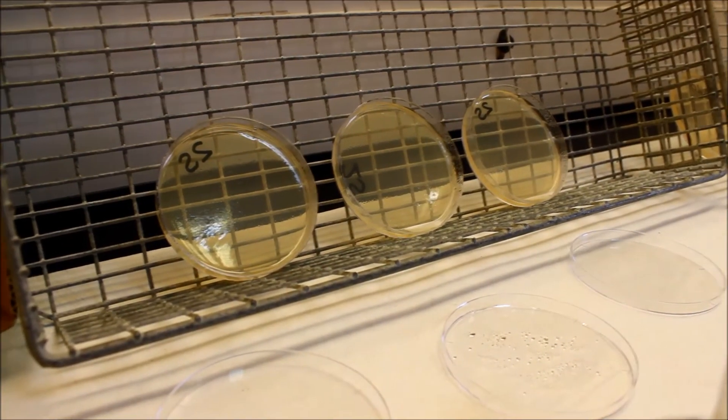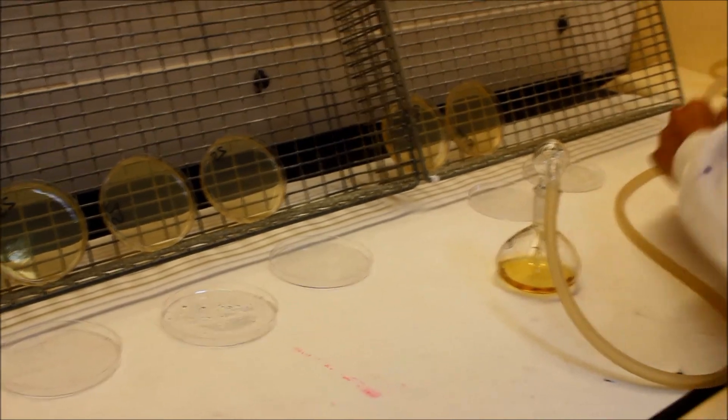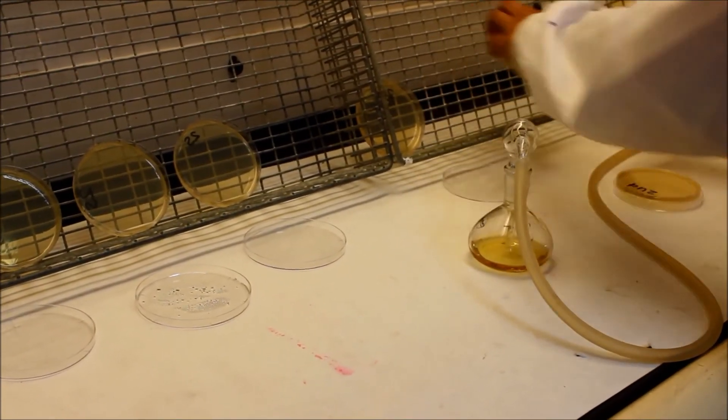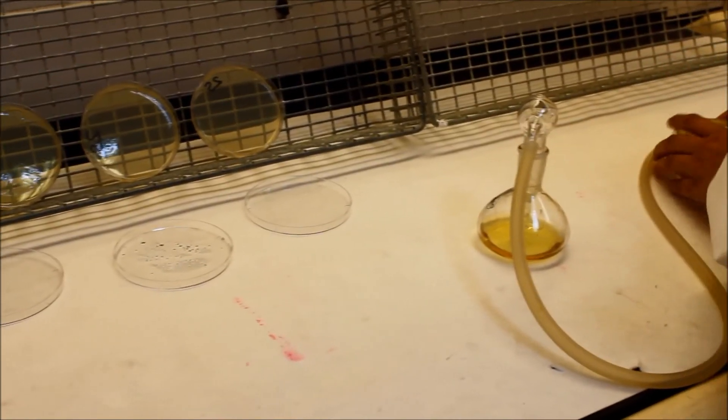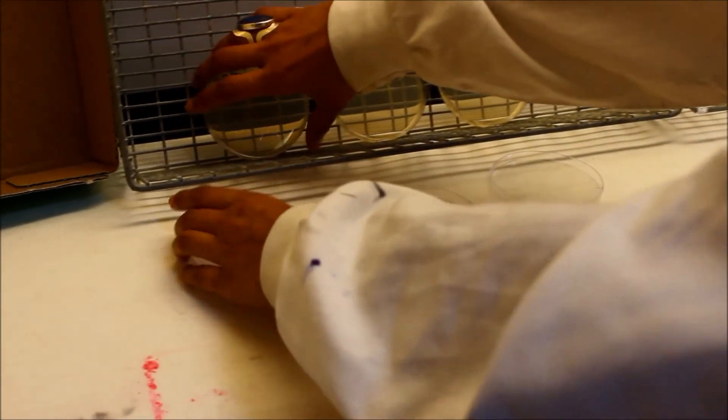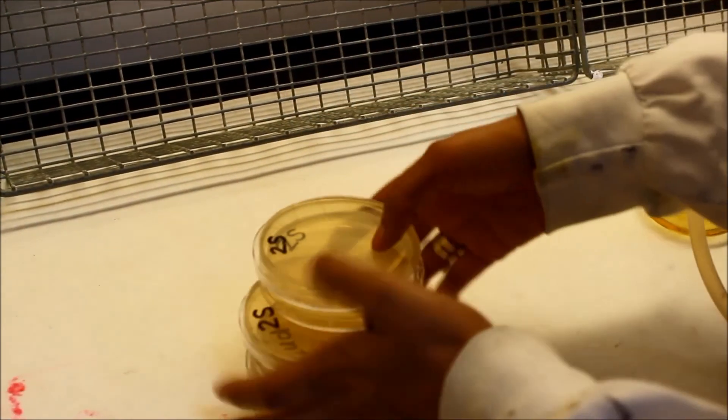Once you have finished spraying your 3 spread and 3 undisturbed plates with phage, replace the lids carefully. These plates will get incubated at 30 degrees Celsius. You must incubate these at 30 degrees Celsius, not 37 degrees Celsius.